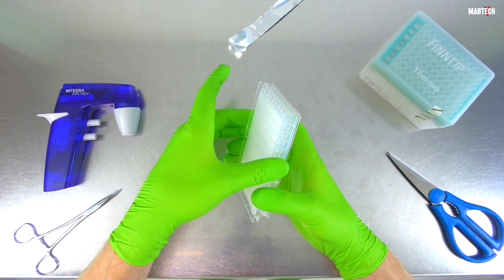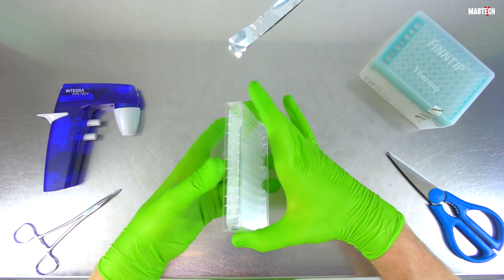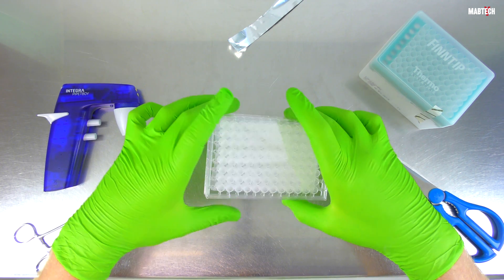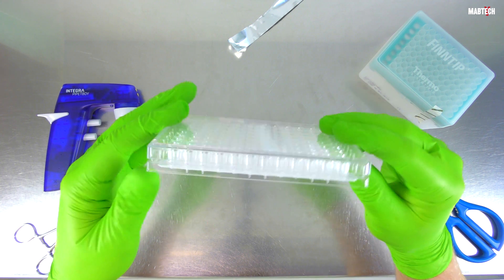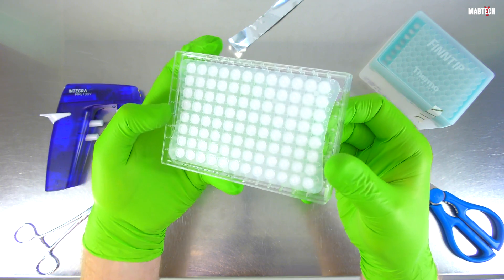While filtration is never used in the ELIspot assay, we still have to consider three points related to the underdrain and how it can affect your ELIspot data if handled incorrectly.